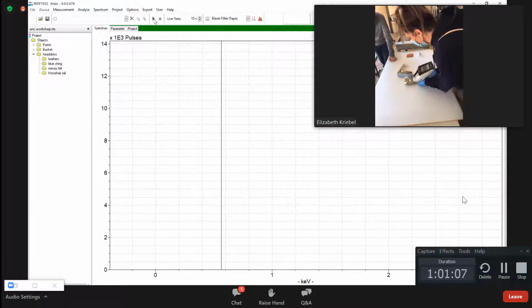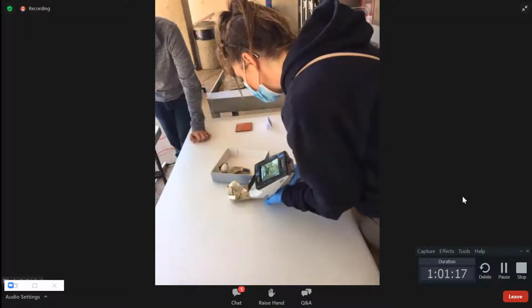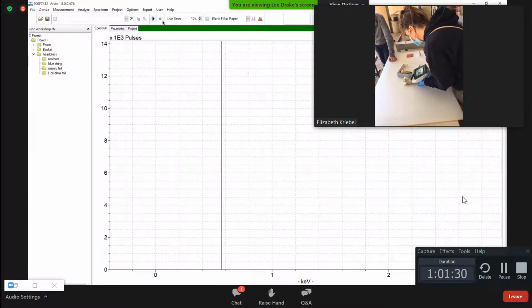And let me know if you can see. Yeah, and you want to put it right up on the surface. Make sure your fingers aren't in the way. Yeah, there we go. Move that hand back. I'm going to turn your screen off for just a second, so they can see how it's measuring it. We're just carefully measuring on the side there. All right, can I grab the screen again? Are you ready? All right, starting.